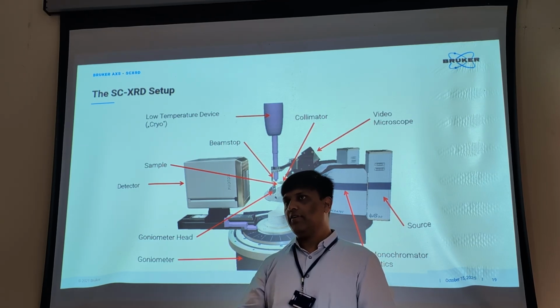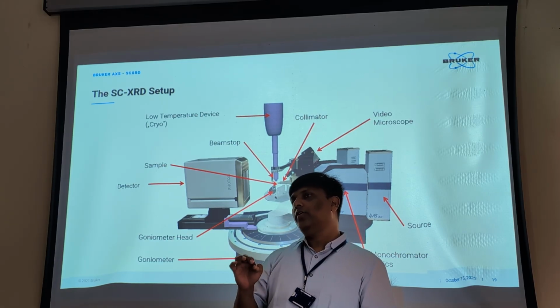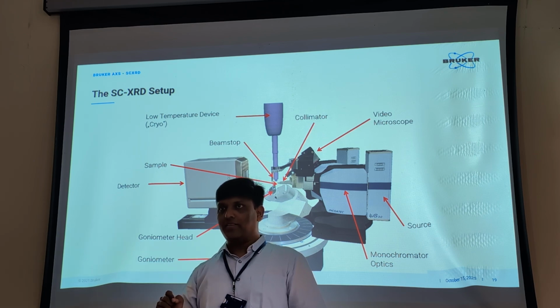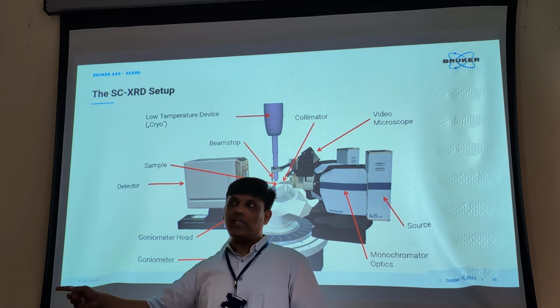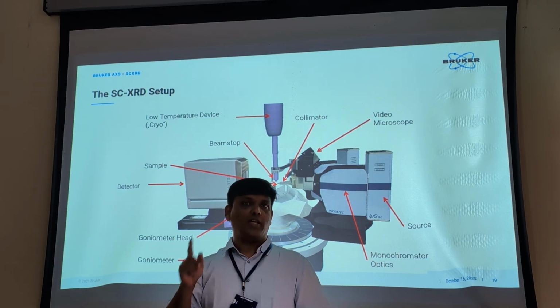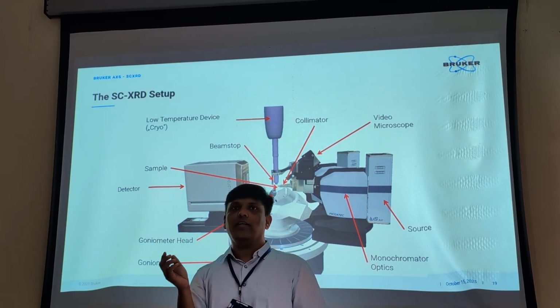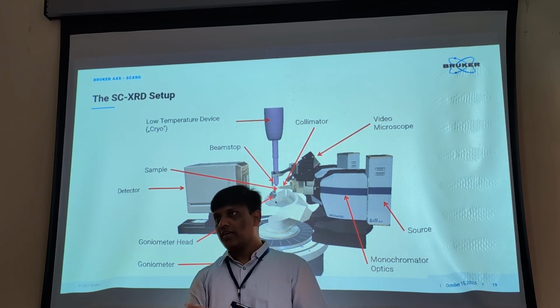So don't just give some average quality crystal, because you are trying to determine a very accurate part of your structure. So for that, the data has to be really good. The data has to be really good means your crystal has to be really good. So don't then complain to the operator, "I was not able to get the absolute configuration."